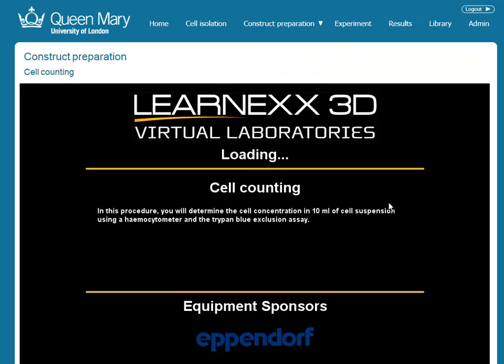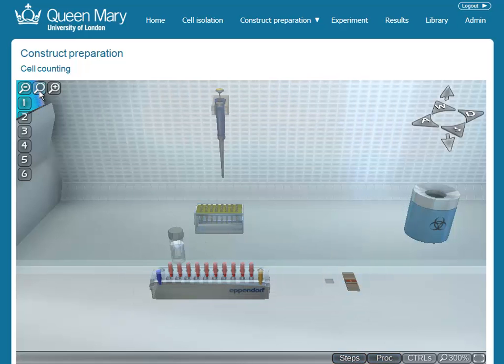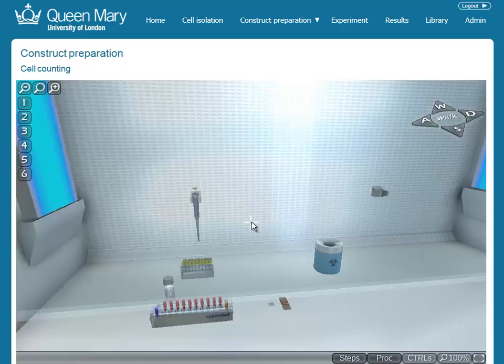LearnX 3D uses the latest games technology to provide a very realistic 3D environment where students can perform lab work from wherever they have access to a PC.